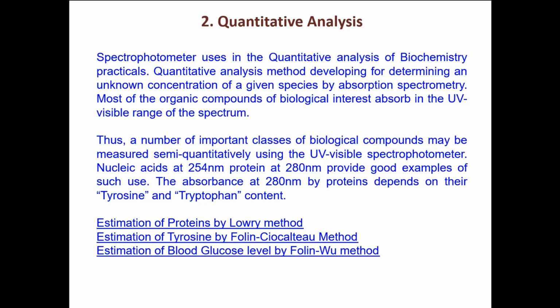After 10 seconds, you go for the reading. You'll get some reading, because by that time there is a conversion of lactate plus NAD into pyruvate and NADH. As and when the NADH concentration increases, the absorption, or the optical density, will also increase. When it increases, that is directly proportional to the rate of reaction of the enzyme. So this is what we will do.